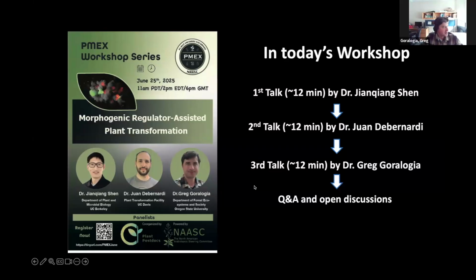Yeah, so we've done some testing. Originally, the whole point was for me to try and do it in Golden Gate, and I had to make some cloning compromises with the orientation. Especially, these are big regions, so 10 kb, you're going to have like 20 BsaI sites, so a lot of mutagenesis. Putting the 6B gene next to the left border, where it might get truncated, for sure reduces the activity.